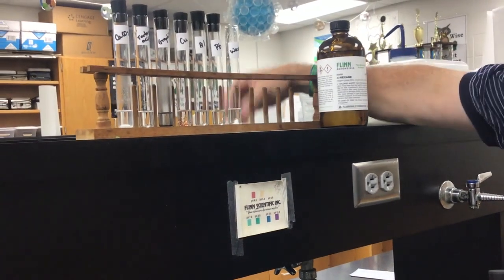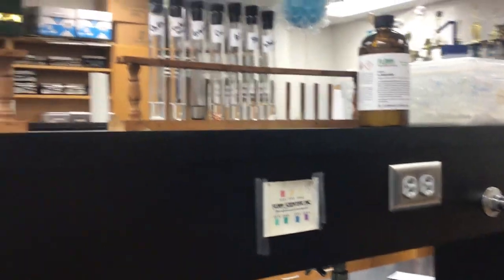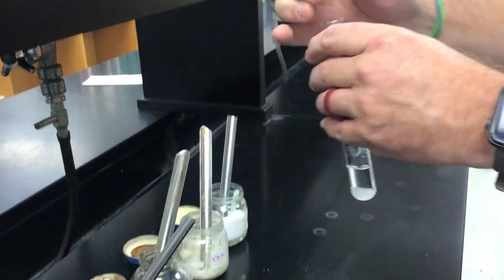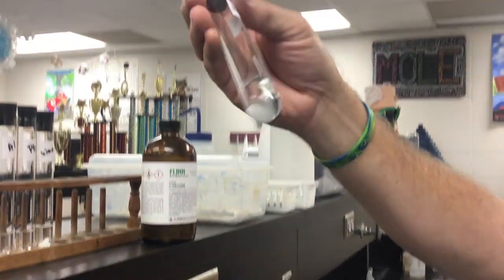Uh-oh, lost my wax lid. Wax stopper. All right, for the NaCl, a little bit of NaCl in that. Just a little bit more. You can actually see it. So that's the salt and the stuff. You can kind of see the salt sitting on the bottom there.